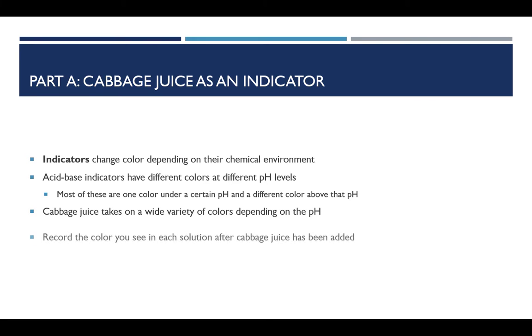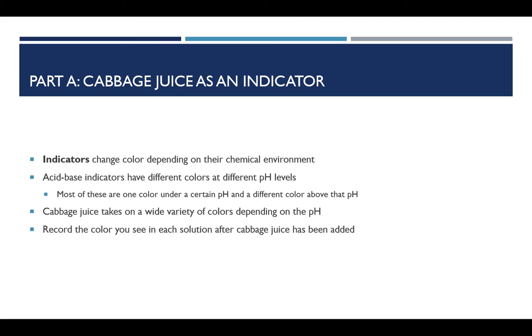Record the color you see for each solution to the best of your ability. We will use this information again in Part B.